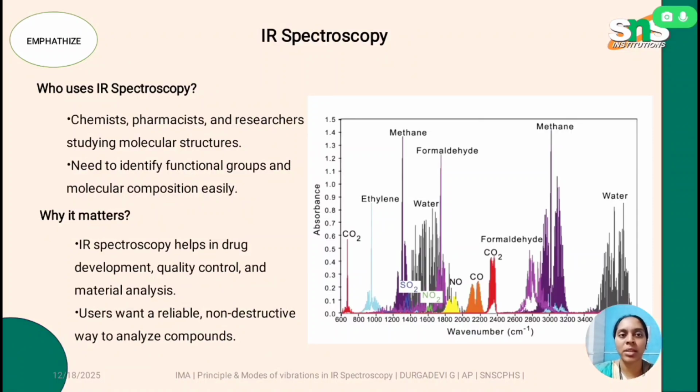Hi everyone, in this lecture video I am going to discuss IR spectroscopy. IR spectroscopy is often used by chemists, pharmacists and researchers studying molecular structures.